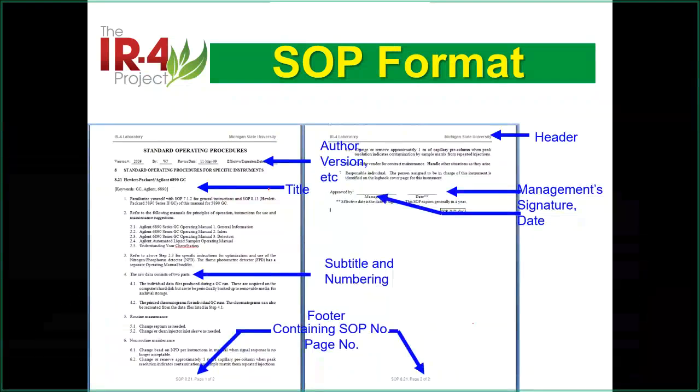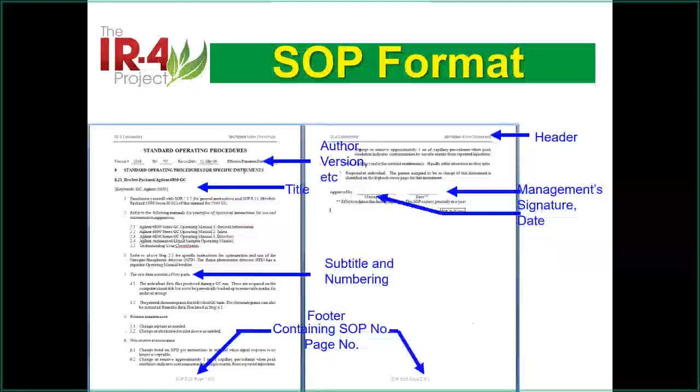First, let's talk about format. You will see we have the IR4 laboratory on this corner here. That's format. We have a line here, and this is Michigan State University. So it's in all our SOPs, in the same format. So no matter how you do the work, you bring this somewhere, people can see, yes, this is your SOP.